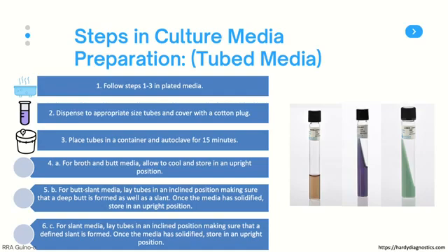And lastly, for slant media, lay tubes in an inclined position, making sure that a defined slant is formed. This is usually done by laying the tubes at a 15 to 30 degree angle. Once the media has solidified, store it in an upright container.